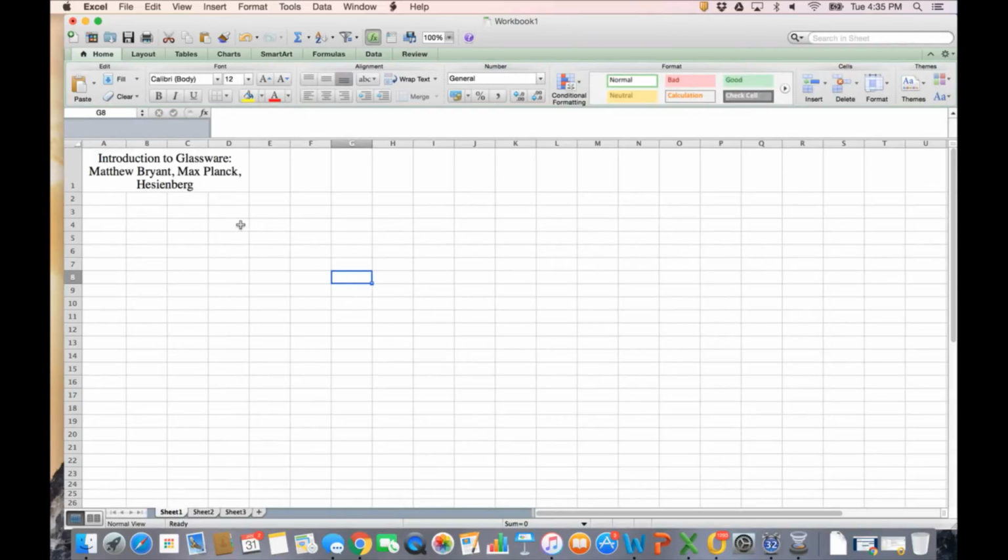Okay, so there are two things that we need to do as far as data calculation that you need to show me in this particular spreadsheet, and you need to show me the average for the two pieces of glassware we used. So for the 25 milliliter beaker here, notice we have again another situation where it's longer than the box.